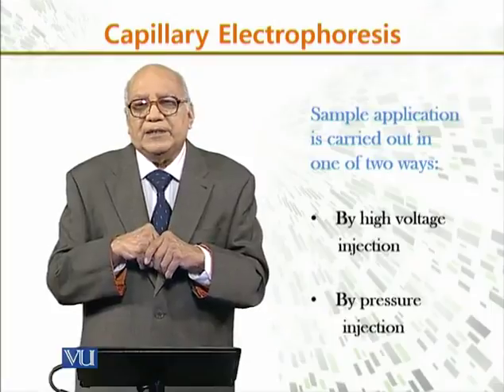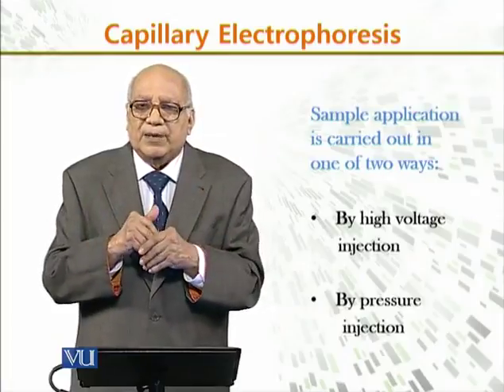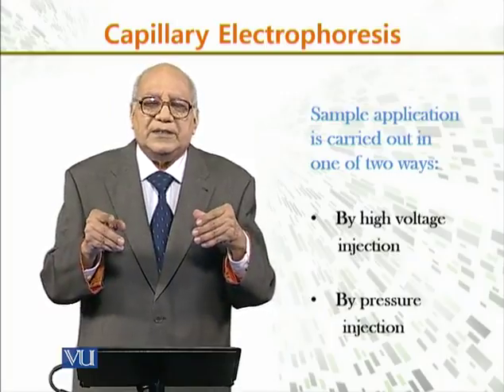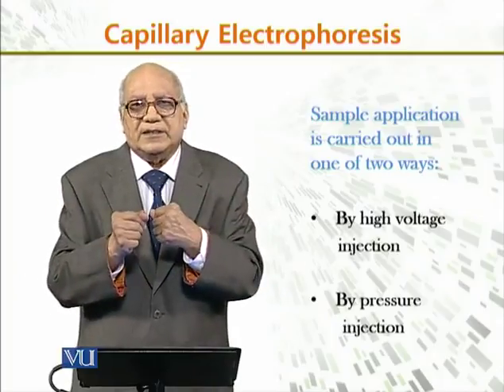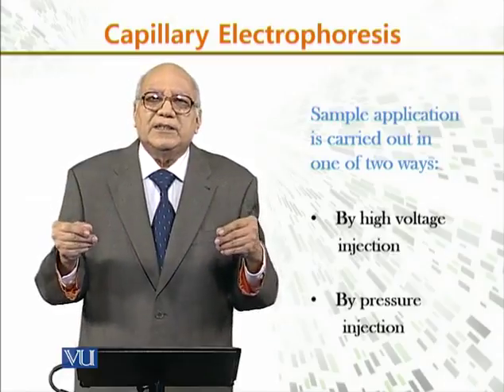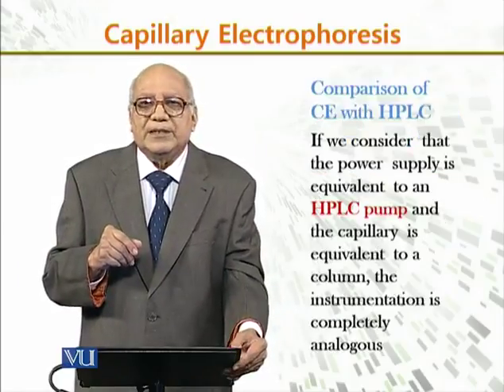Now, sample application in capillary electrophoresis is carried out either by high voltage injection, where a high voltage is applied and the sample is filled in, or by pressure injection. So you can use both techniques.